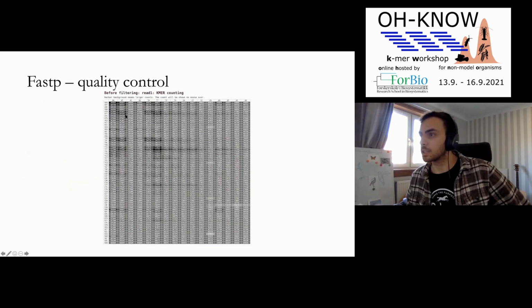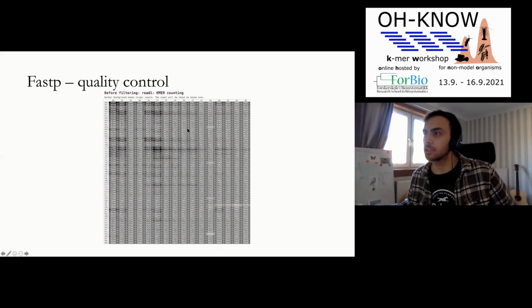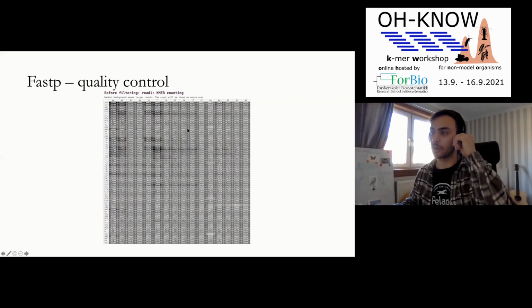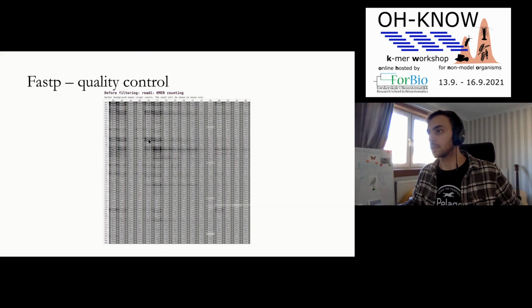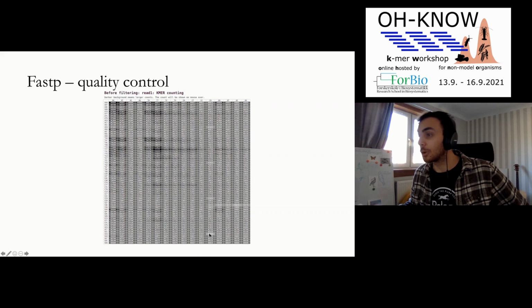It will also output a matrix like this, which actually links a little bit to this workshop. This is a k-mer counting matrix, and here it uses this color gradation system to show under- and overrepresented k-mers. The darker the color, the more overrepresented. You can see here this TTTTT is very abundant, same with the poly-A. But this one down here, for example, is lower than expected.